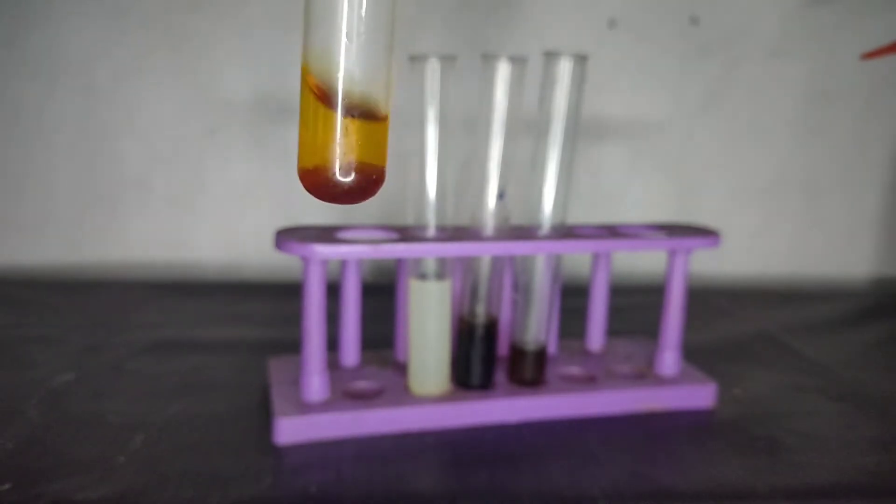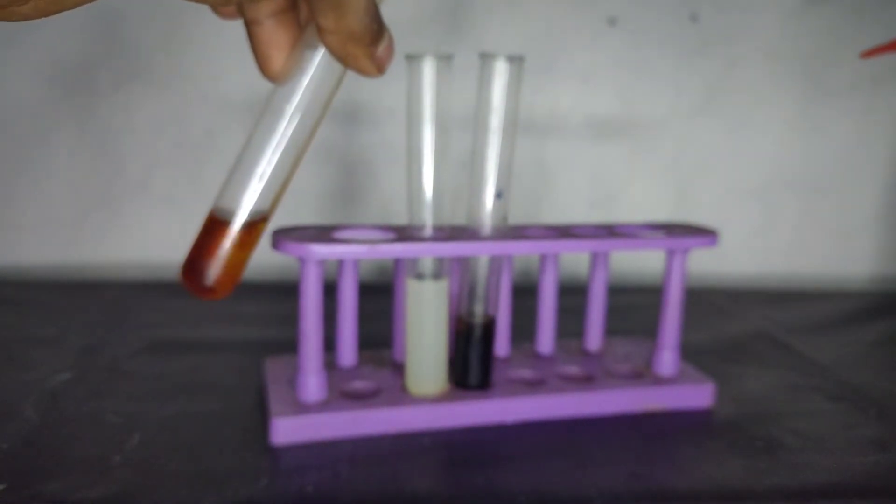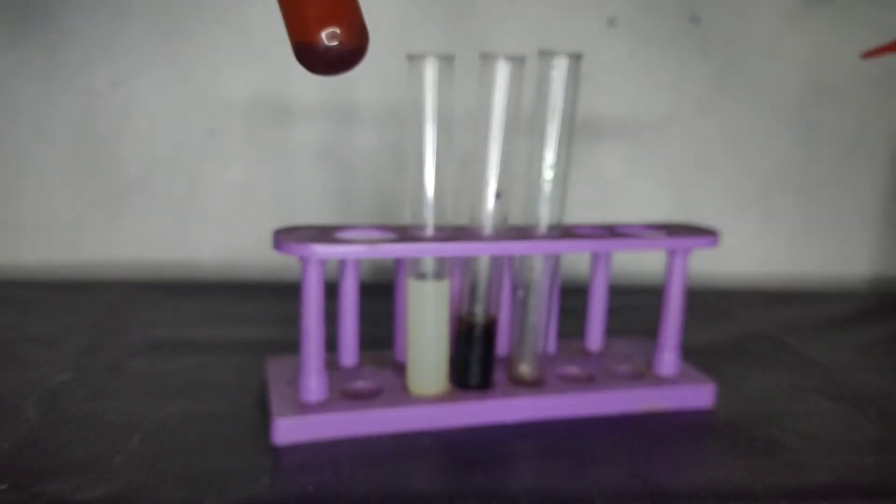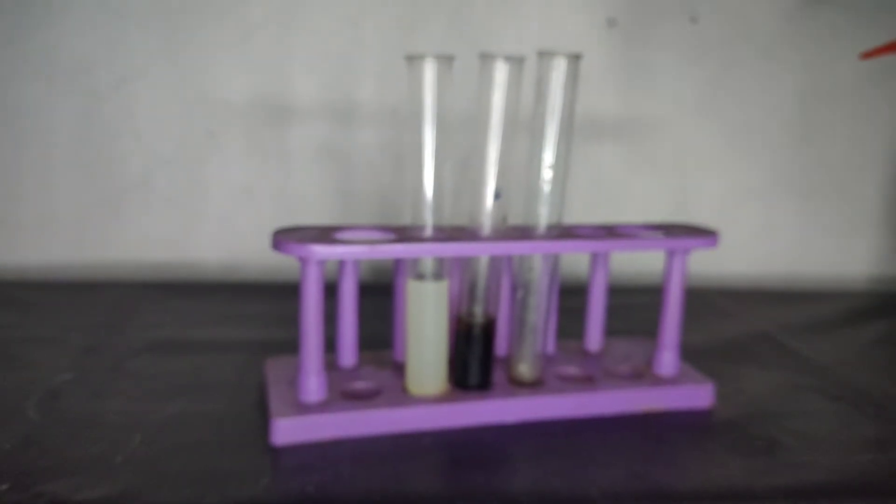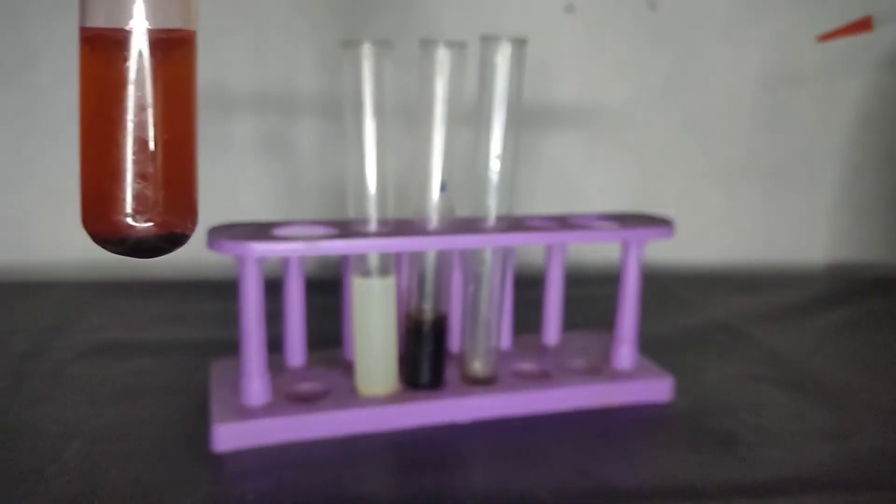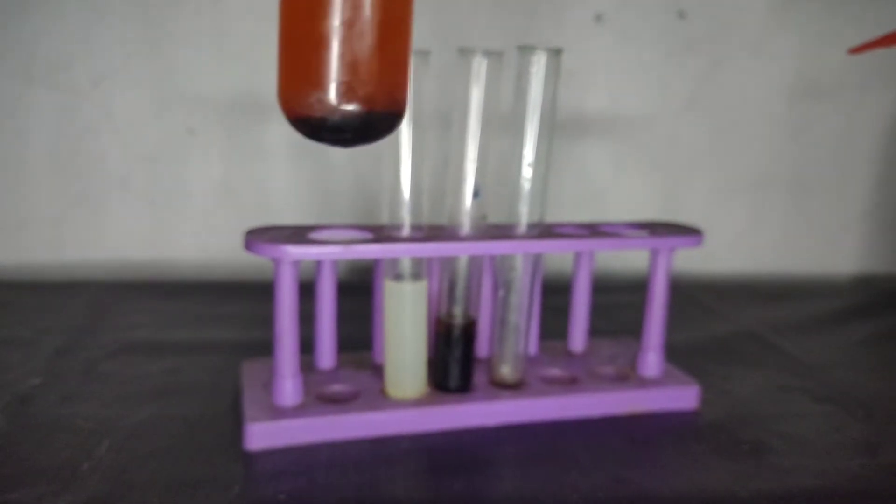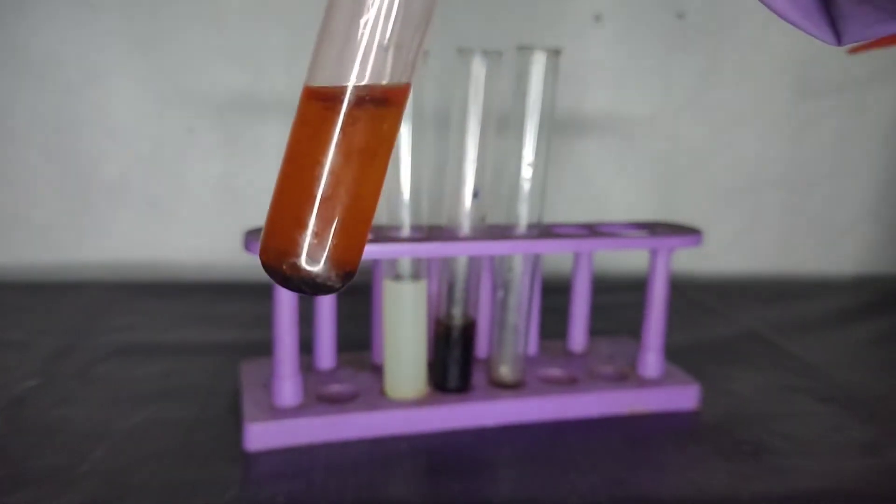If you add more chlorine water, let's add chlorine water in excess. Now give it a shake. Now you can see that the organic layer is so dark that you can't even see the color. But it's violet in color.